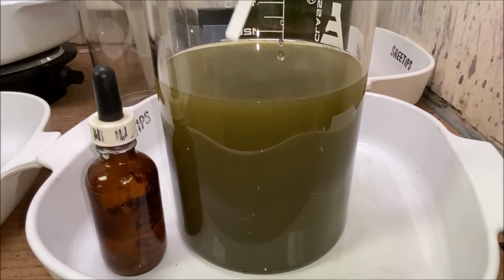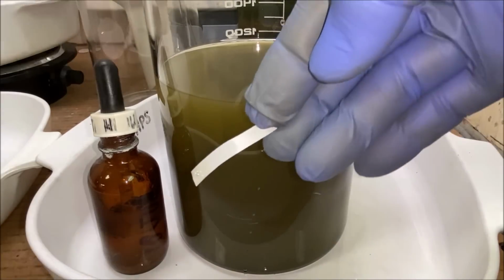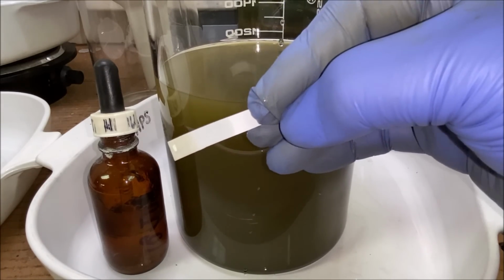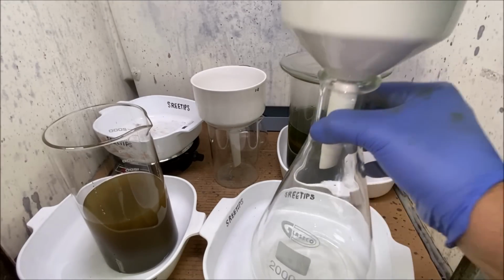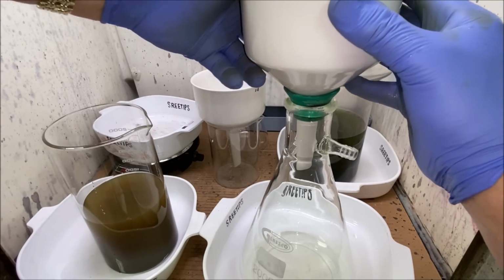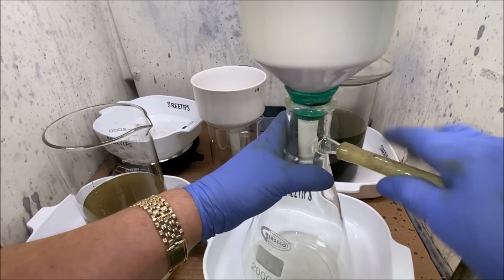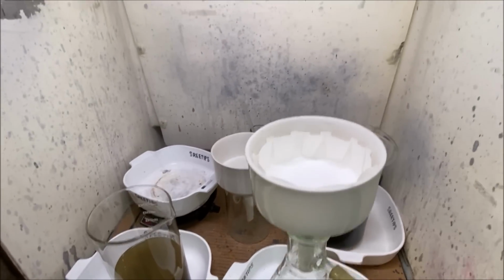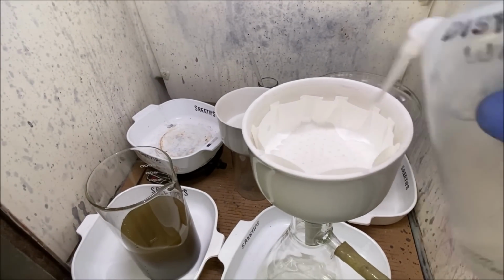Let's do a quick stannous test. You can see there, all the gold has been precipitated. Set up a filter flask now. And what we'll do is capture our gold in this filter. Let's see, let's wet this a little bit first.